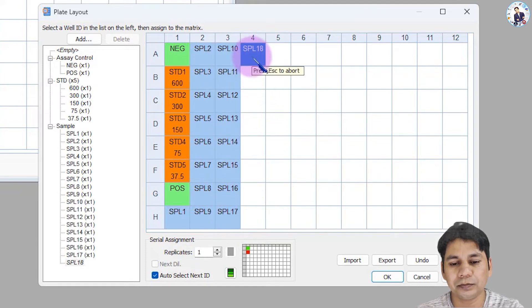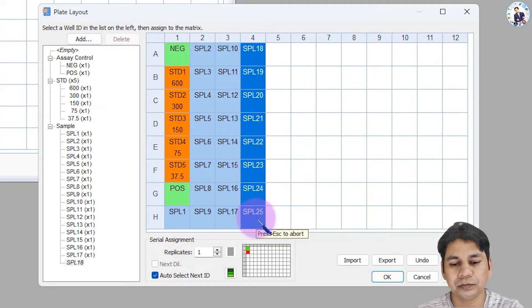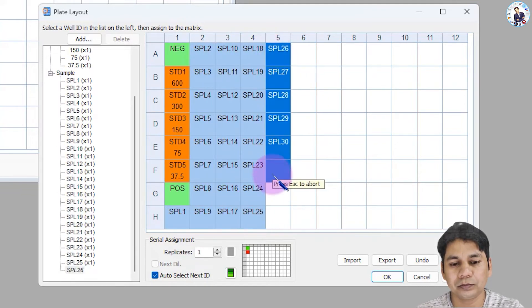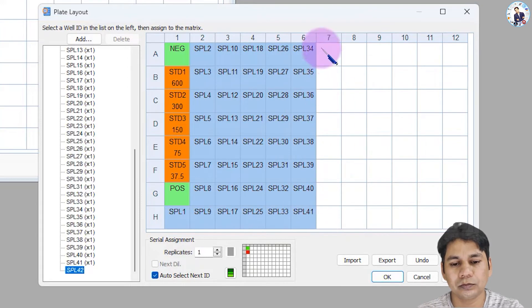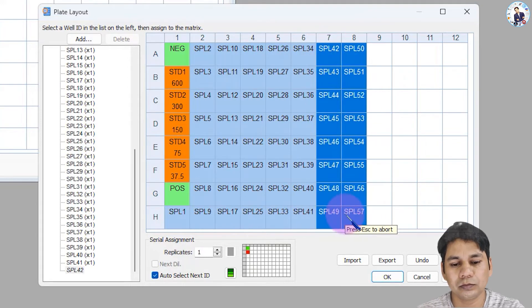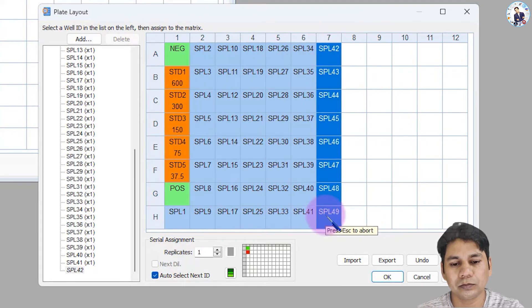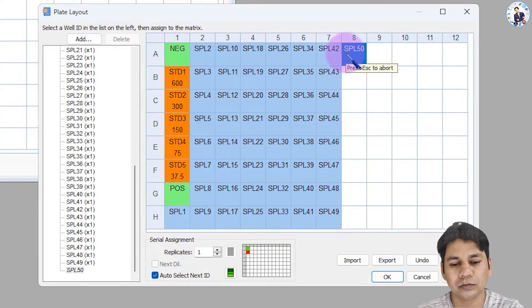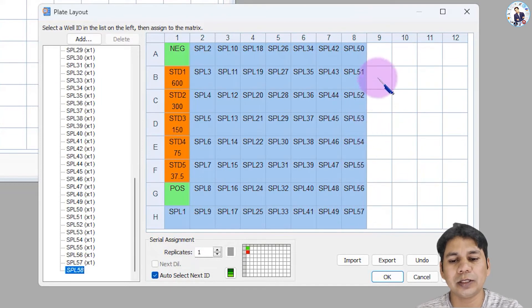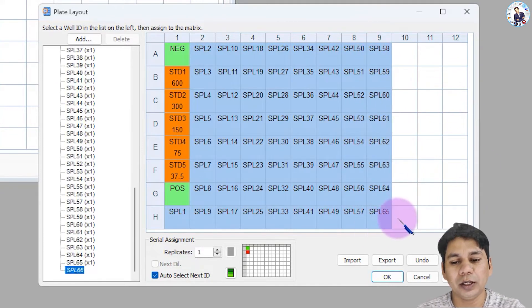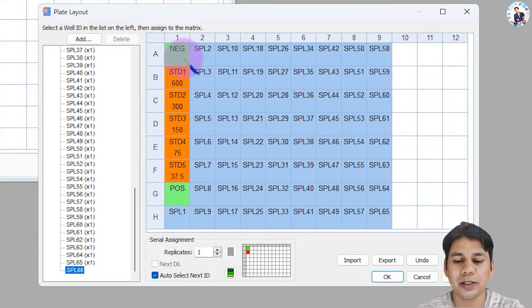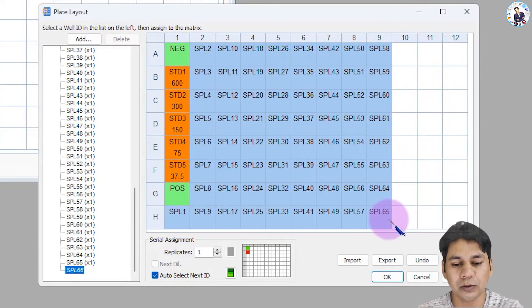All other wells up to column 9 contain samples, so I am selecting the wells to assign the samples. You can see my plate layout: one negative control, one positive control, five standards, and a total of 65 samples. Click OK.